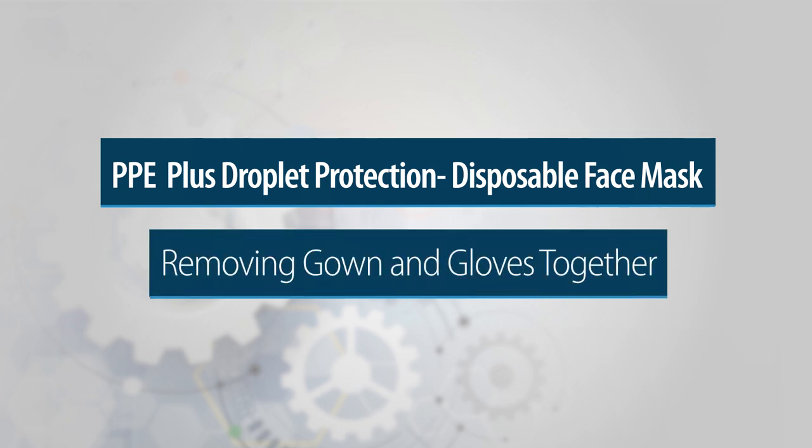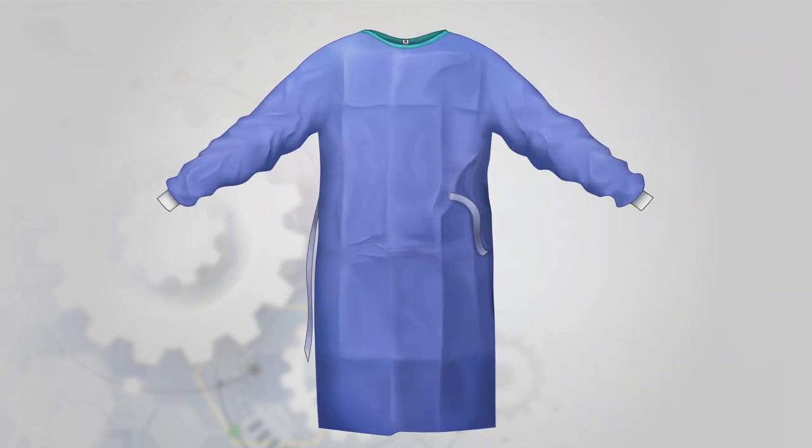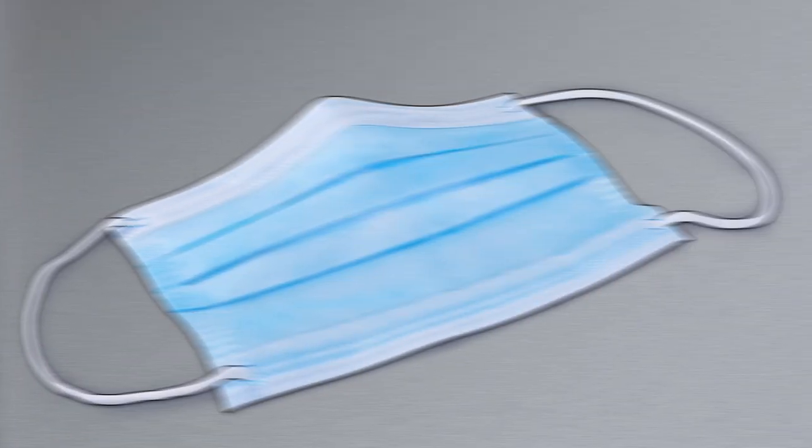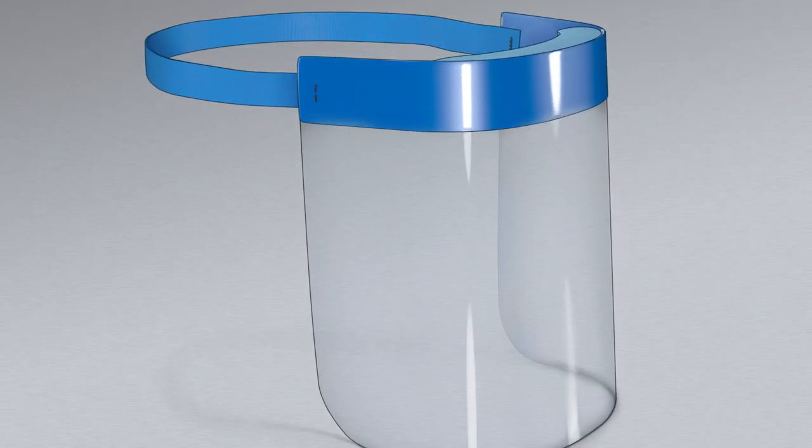This video demonstrates the donning and doffing of the following PPE: gown, gloves, disposable face mask, and face shield.